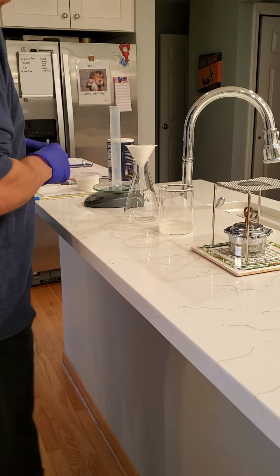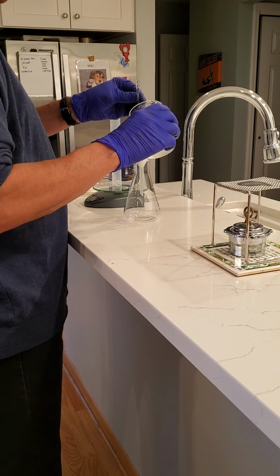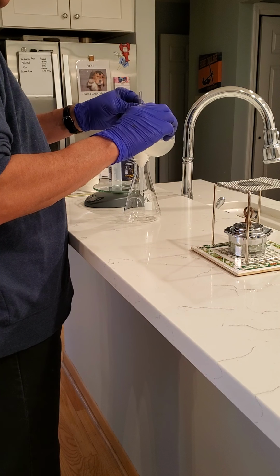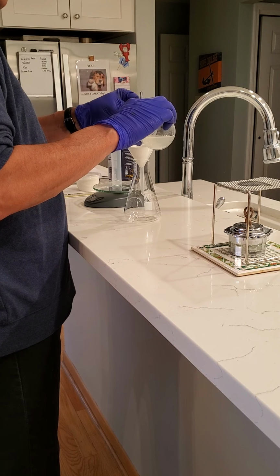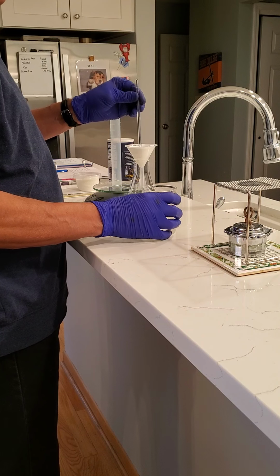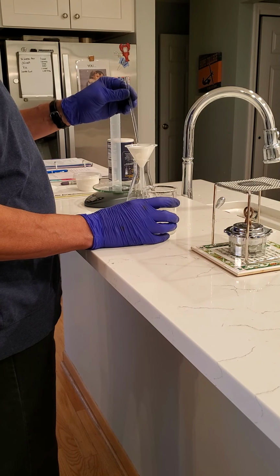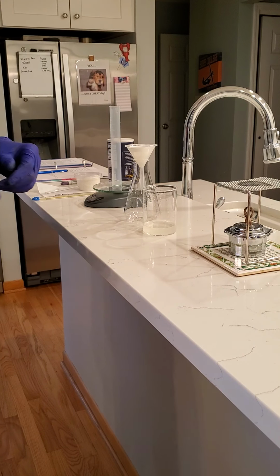This may take a few minutes, and I'll have to come back after it's filtered through because sometimes the filtration takes a while. We don't want to overrun the filter paper. Okay, so we're going to let that filter, and then we'll be back for the last step.